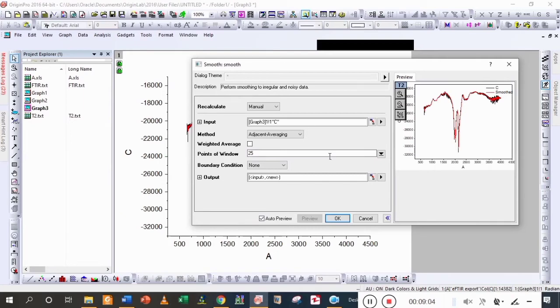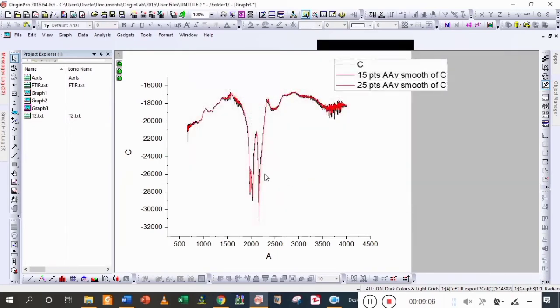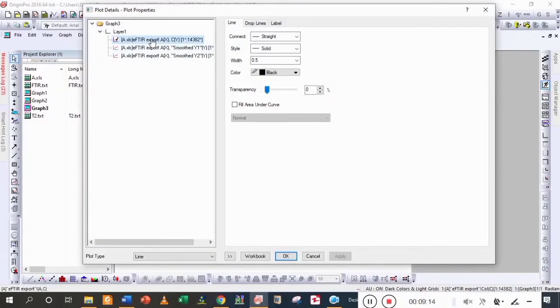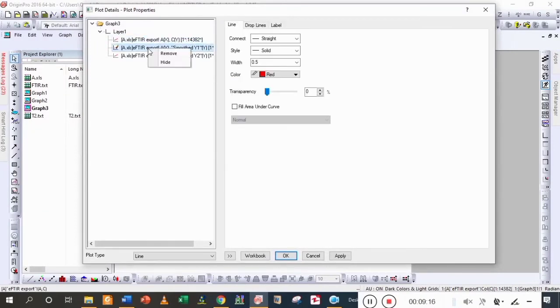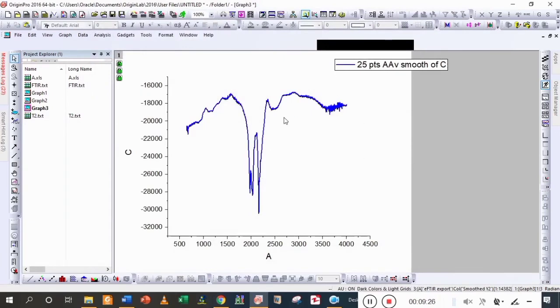You can see that here are three values: the first one is black, the second is 10 or 15 points, and the third is 25 points. We choose the 25-point smoothed value and change its color.